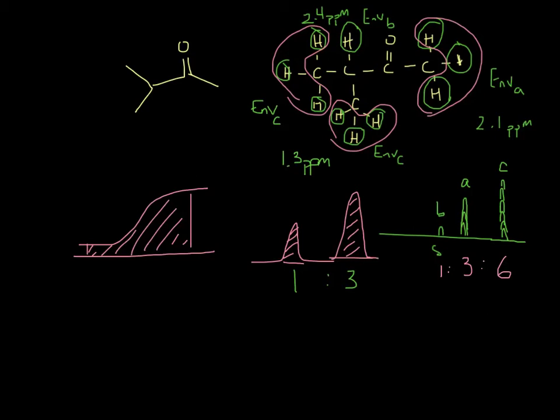It does give you a ratio, so it is of course possible that this could be 2 to 6 to 12. It's just a ratio, but it's an extremely important amount of information, and by the mass you could figure out roughly how many hydrogens are in there. And there's a very big difference between something with 10 hydrogens, which we saw up there, as compared to something with 20 hydrogens. So that's something that we can work out pretty simply. But that ratio is a really important thing for us to be able to get.